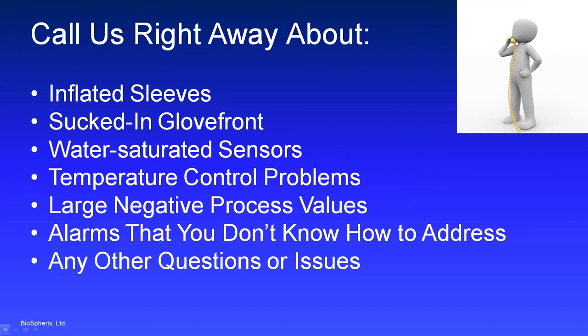If you have any large negative process values, like your sensor is turned on, the controller is turned on, but it's still reading negative 88,000 something, give us a call. We're going to want to troubleshoot what's going on with that particular sensor. Give us a call if you have any alarms that you don't know how to address. And of course, give us a call with any other questions or issues that come up.